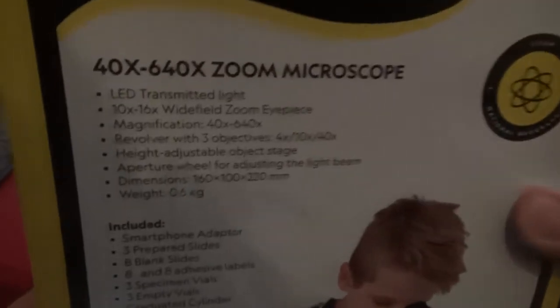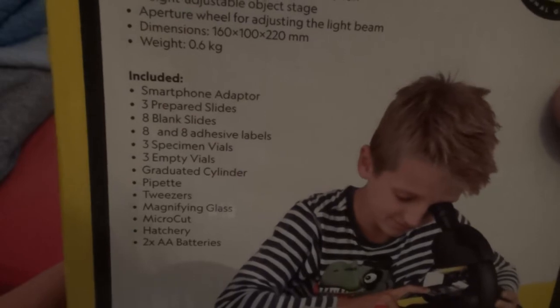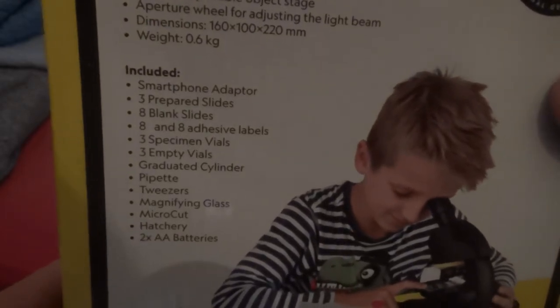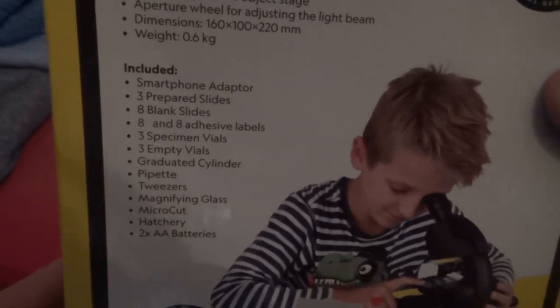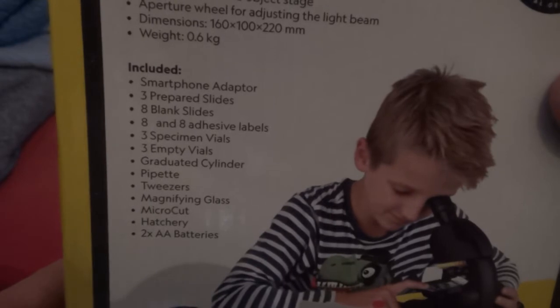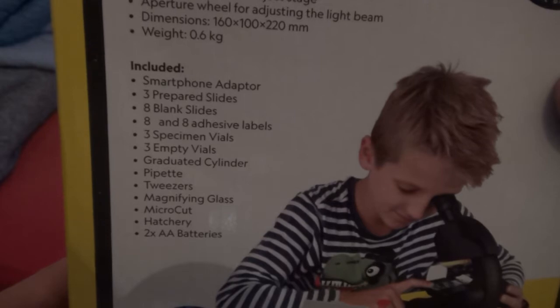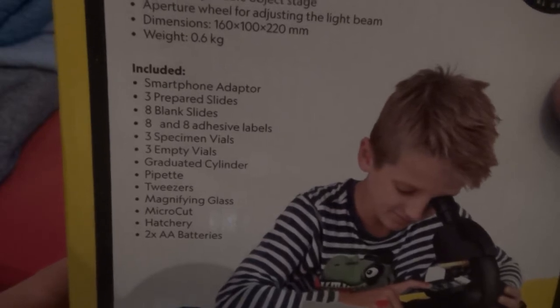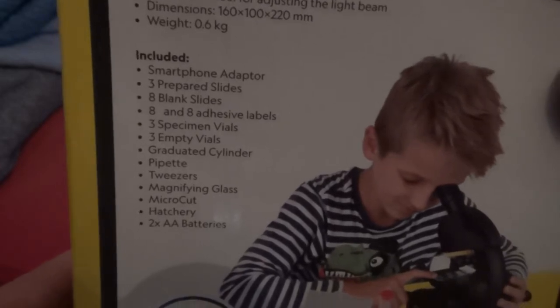Here are the specs — you can pause it to read it. And here is what's included: a smartphone adapter, 3 prepared slides, 8 blank slides, 8 adhesive labels, 3 specimen vials, 3 empty vials, a graduated cylinder, and several additional vials and accessories.